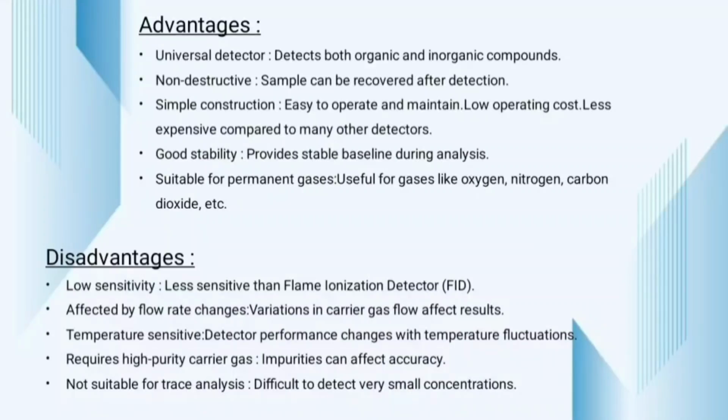Disadvantages: low sensitivity. Variation in carrier gas flow affects the results. Detector performance changes with temperature fluctuation. Impurities can affect the accuracy.